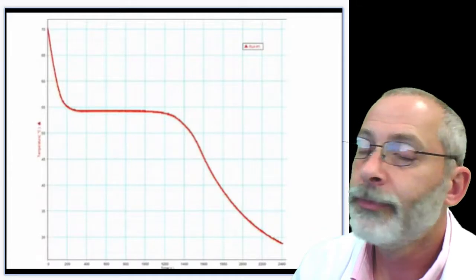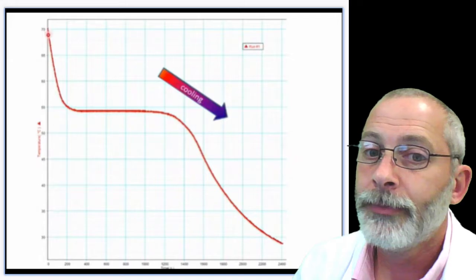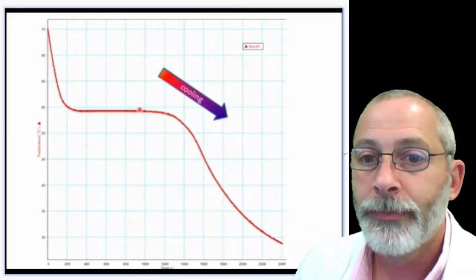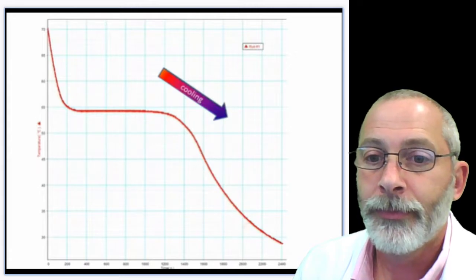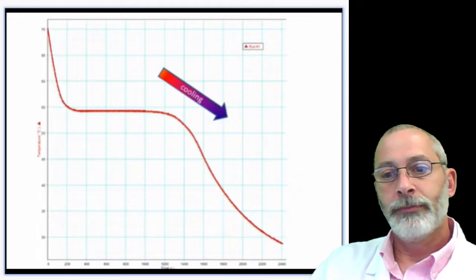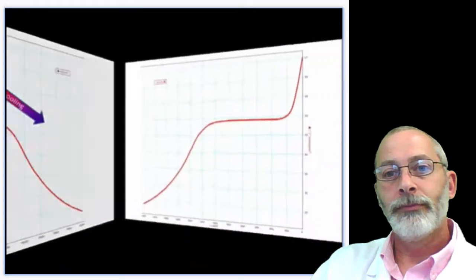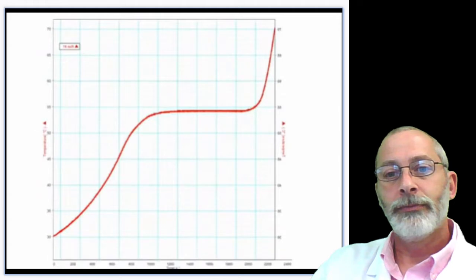This is the cooling curve that was produced. You'll notice that the temperature of the acid cools rapidly at the beginning, but then it doesn't cool at all for a good number of minutes. After some point, the temperature starts to cool again. To consider what's going on, it might be easier if we imagine the graph flipped around. That is, imagine what it would look like if we were heating it up. This is a mirror image of the original cooling curve.